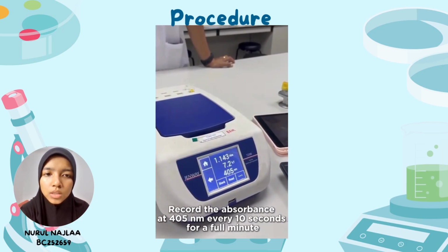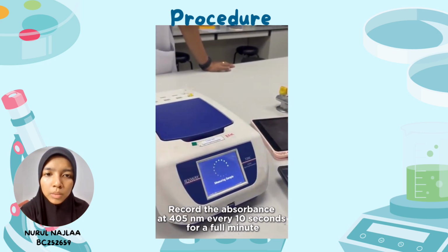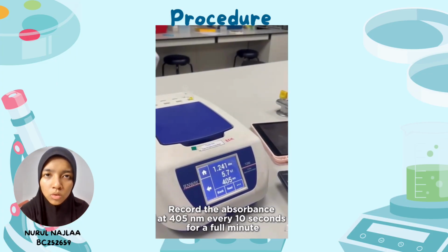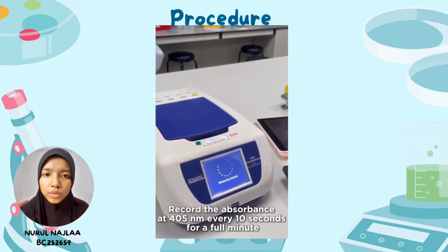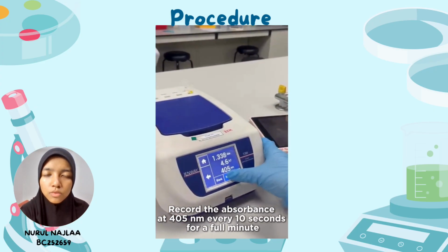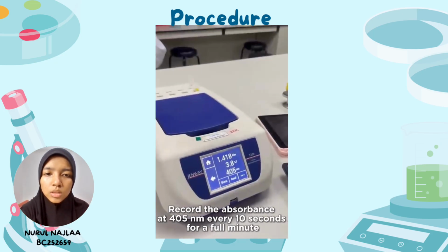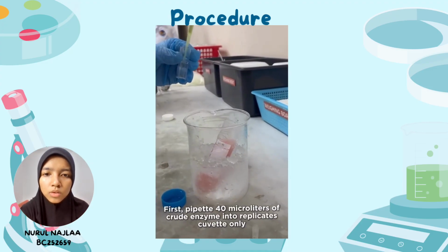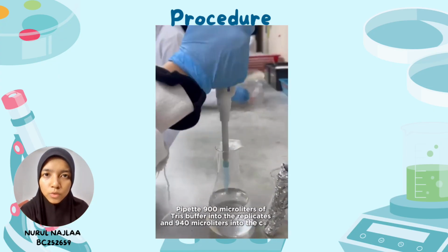Immediately after adding the substrate, we mix the solution quickly and thoroughly using a micropipette tip and place the cuvette straight into the spectrophotometer holder. We take our very first absorbance reading right away at 0 seconds at a wavelength of 405 nanometers. Because this is a continuous kinetic assay, we monitor the real-time progress of the reaction by recording the absorbance reading every 10 seconds for a full minute.